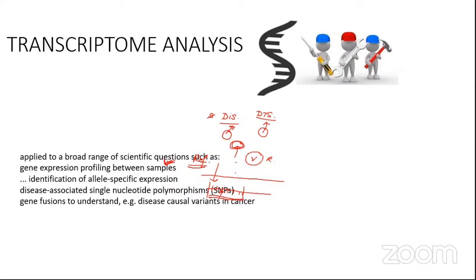If I see this particular gene is highly expressed, and I see variations compared to the reference, then I can directly correlate that this particular variation is directly correlated with the high expression of my gene. Considering that in the normal sample, this is normal, so they are not mutated. The base change is not there.